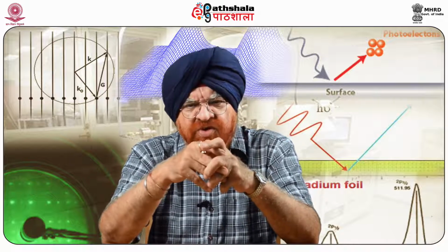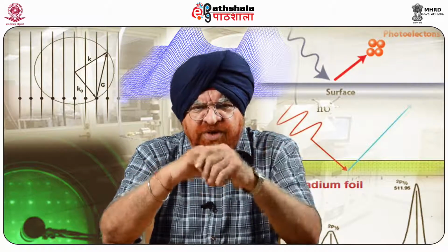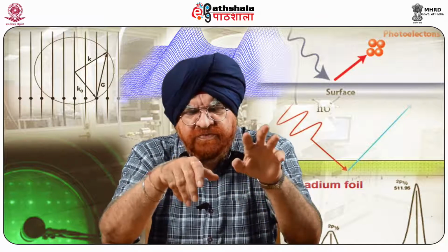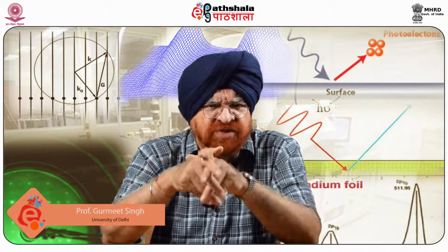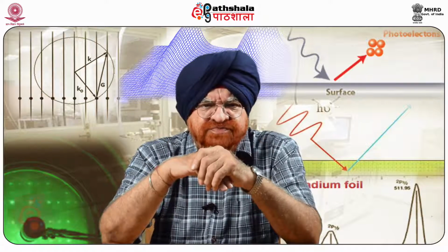The spatial resolution of ECSTM is absolutely superb, but the temporal resolution always has a limitation, of the order of a few seconds, which poses a very big difficulty when we try to understand the fast kinetics of some electrochemical processes. Thank you very much.